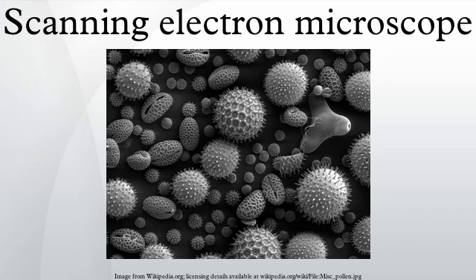In the SEM, CL detectors either collect all light emitted by the specimen or can analyze the wavelengths emitted by the specimen and display an emission spectrum or an image of the distribution of cathodoluminescence emitted by the specimen in real color. X-ray microanalysis: X-rays, which are produced by the interaction of electrons with the sample, may also be detected in an SEM equipped for energy dispersive X-ray spectroscopy or wavelength dispersive X-ray spectroscopy.